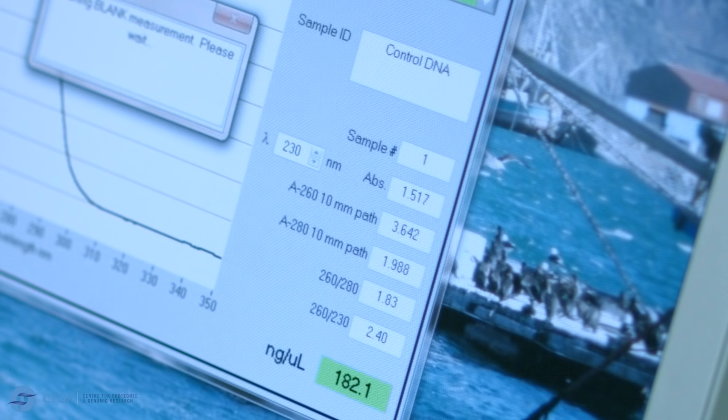Place the bag and accompanying documentation, for example the sample submission forms, export license details, into a shipping box. To summarize, you have been shown how to extract DNA from whole blood, what the quality control checks entail, drying down DNA in a DNA stable plate and packaging of the plate with the dried down samples for shipment.